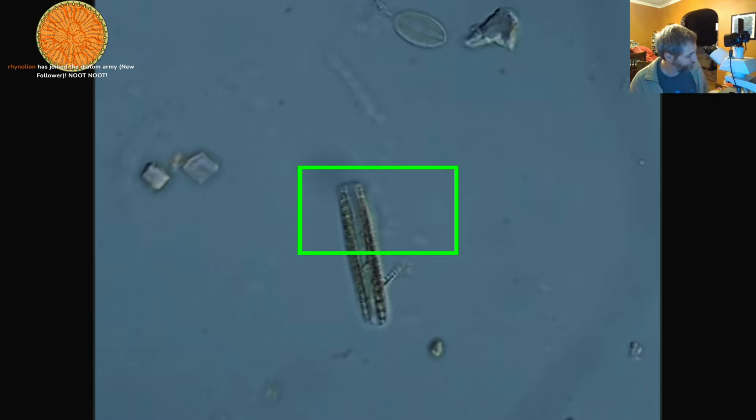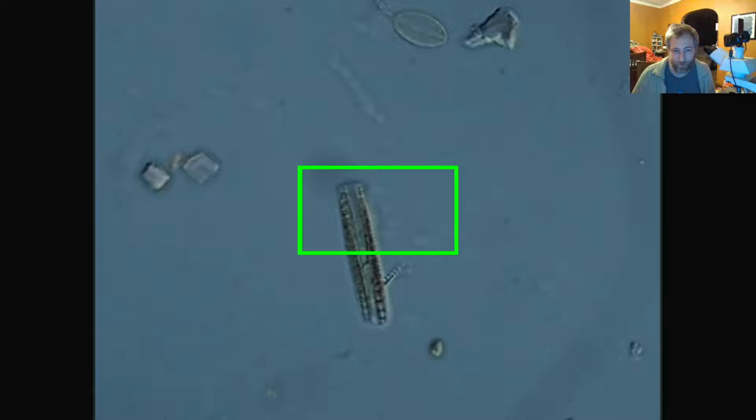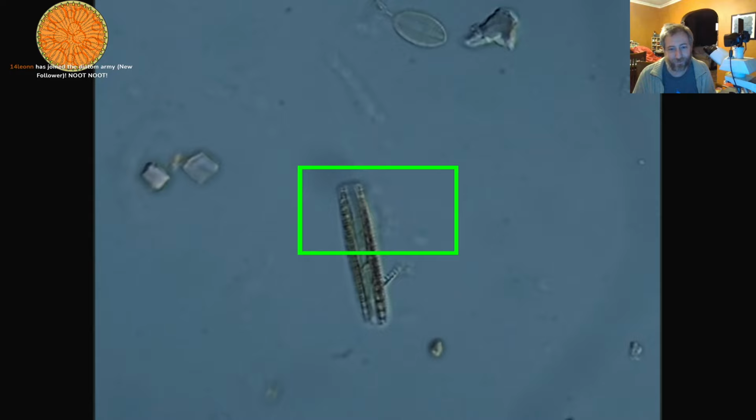sometime in the next week or two, I'm going to do a stream where we actually use a micro manipulator. And I'm going to stream, I think, from the micro manipulator. So I have a stereo microscope, and then I'm going to use the micro manipulator to pick up diatoms and put them down somewhere else. So I'm going to actually pick them up and move them from one place to another and reposition them using a tiny little device with gears that can be used to manipulate very small things.